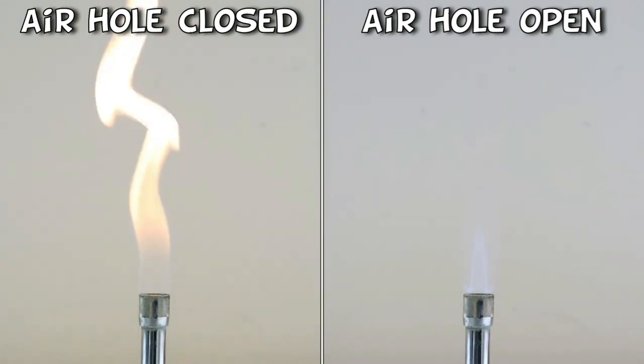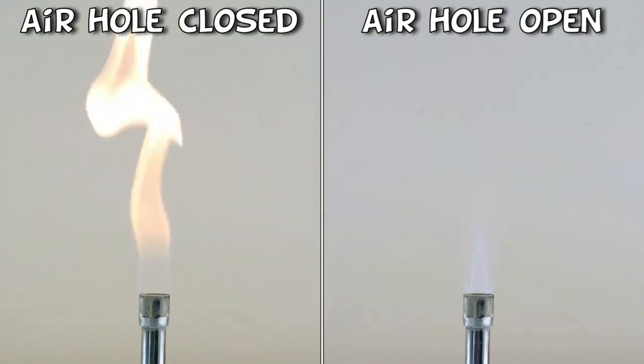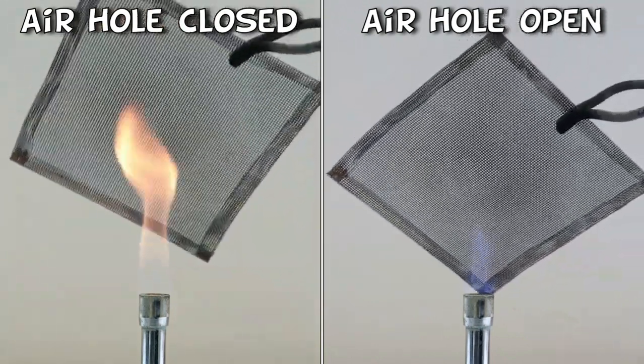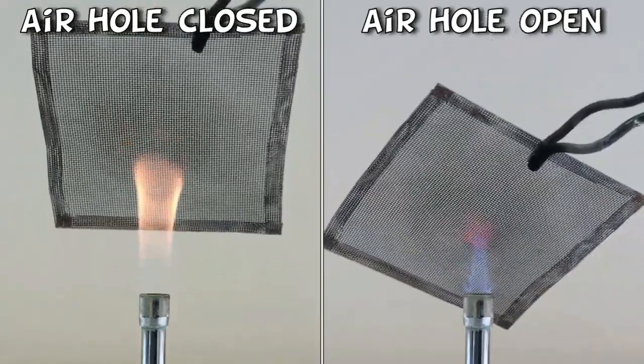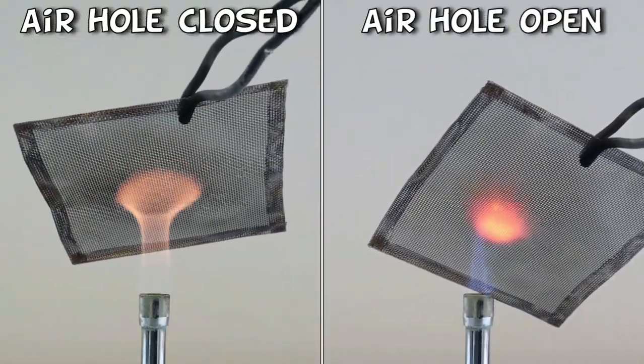This is why the blue flame is often referred to as the roaring blue flame. The next thing I'm going to do is to place a wire gauze into the flames to find out how hot they are. It doesn't take very long before the gauze in the blue flame is glowing red hot, so we can see that this is by far the hotter flame.